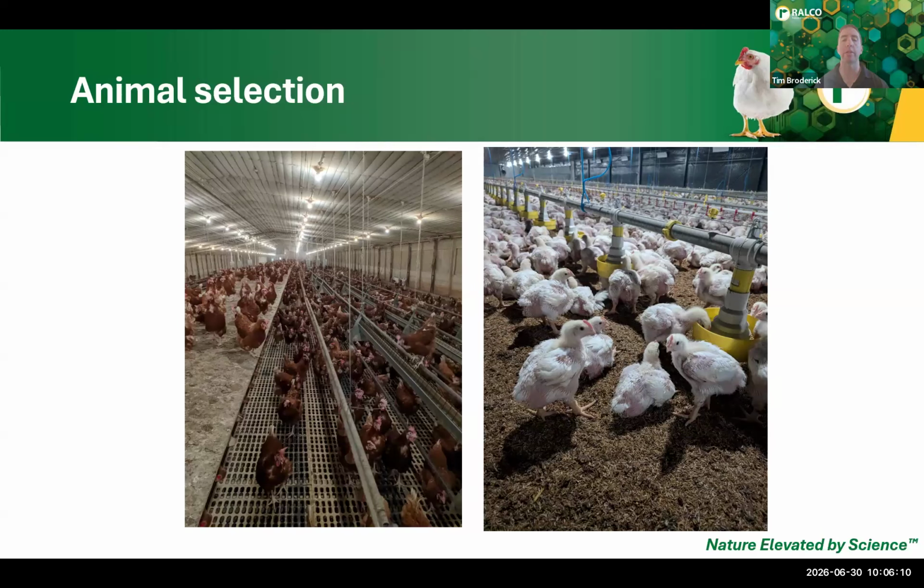So again, once we've reviewed those background protocols and procedures, we have all our equipment laid out, we've understood the records, we're actually now in the barn looking at birds. How do we actually select the animals?